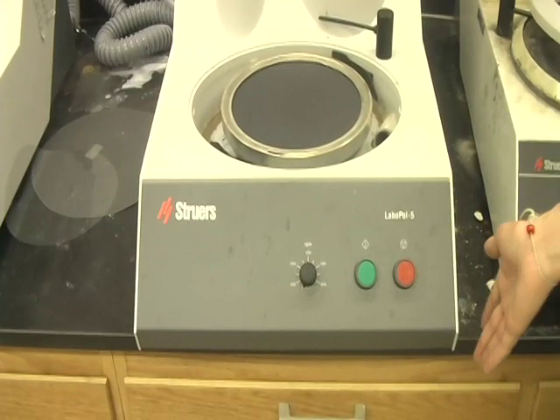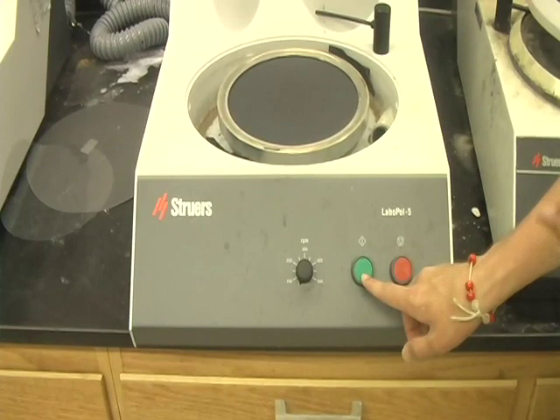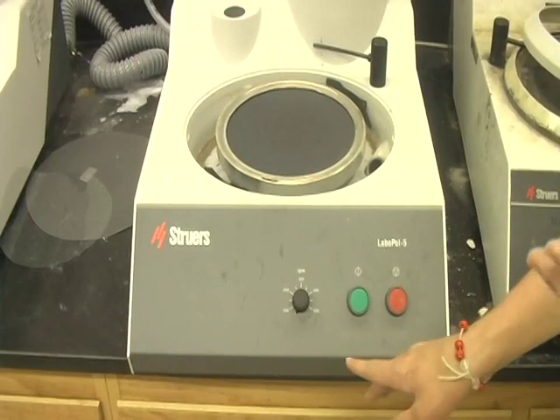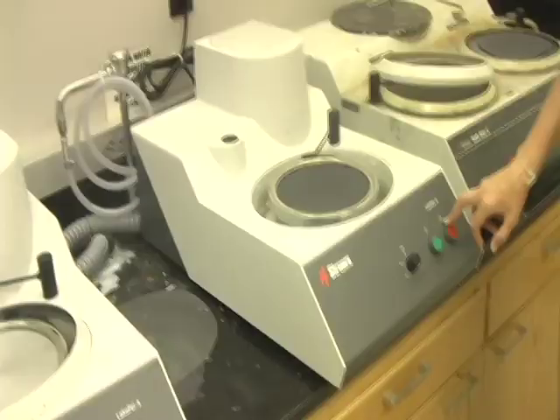Next, to turn the machine on, find the big green button on the front of the machine, also known as the on button — it is located right here. Next, you're allowed to adjust the RPMs, or the speed, on the grinding turntable as you grind. It is located here. The higher the RPM, the faster it goes.